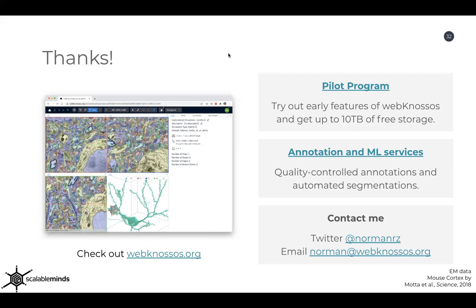But then also when you have some first versions, then you can visualize that. So here we have the screenshot. We have a segmentation map that was created by a deep learning system. It's also flexible enough so that you can upload prediction maps. So you can look at the predictions that are the basis of this segmentation.